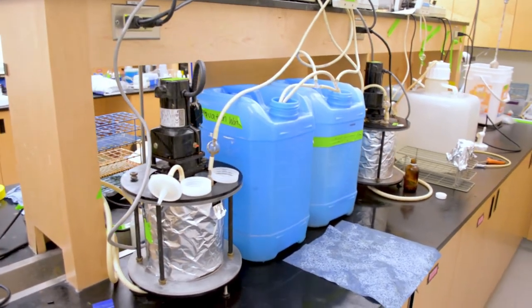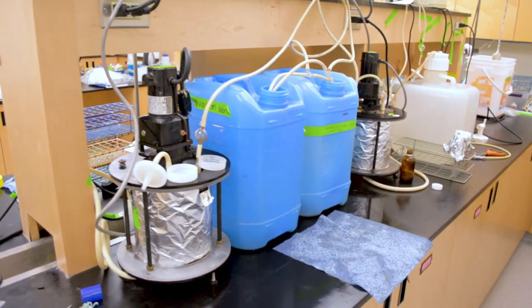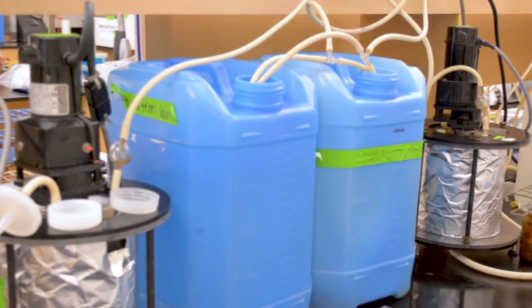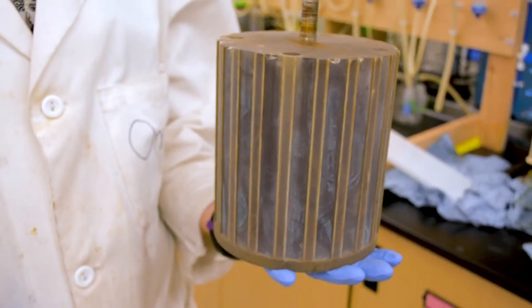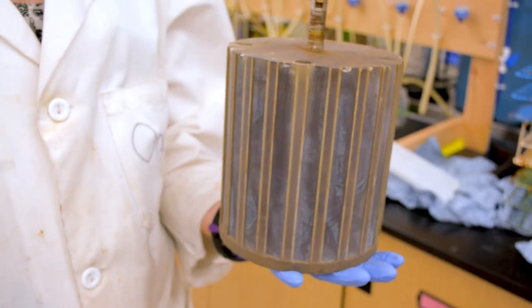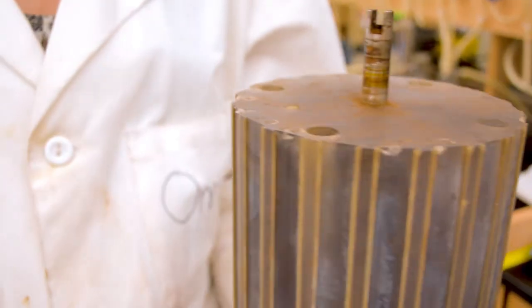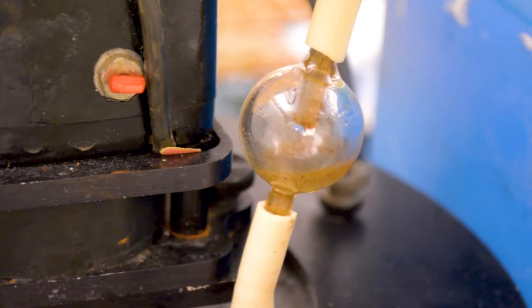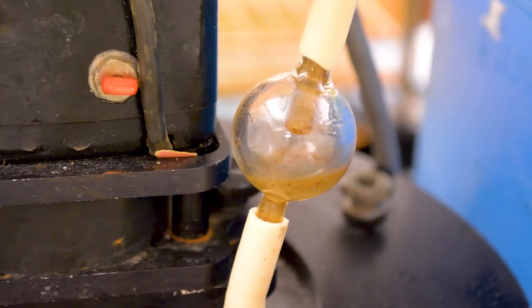We have two reactors that are hooked up in parallel, each one houses the different graphene coatings. There's an inner cylinder that spins at 60 rpm and then we have water flowing through the reactors. With that we're able to simulate that marine environment over a period of 10 weeks, letting biofilm grow in these reactors.